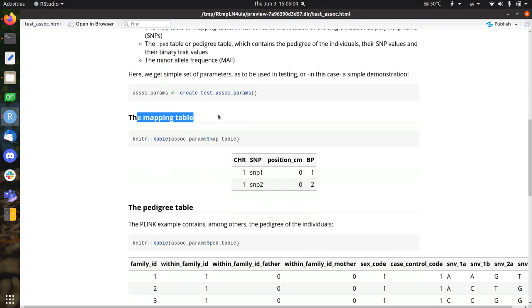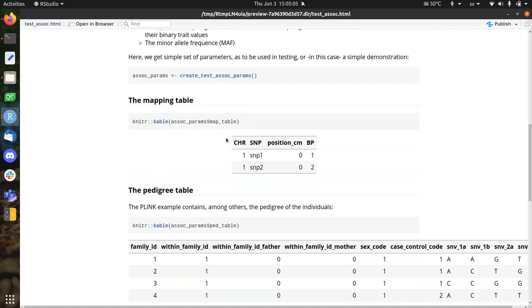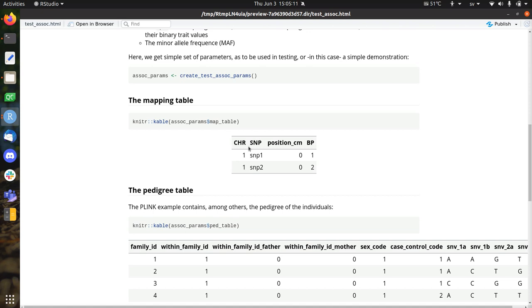So let's take a look at the mapping table. This is how it looks. This is the, these are the default, this is a file that's default in Plinkr 1.9. And it's called test.map. It looks like this. It has two snips on, actually, this is the same chromosome, at different base pairs, base pair 1, base pair 2. Those have a position in centimorgans, which is set to zero, which means that it won't be used in the analysis. So I'm going to use that one.